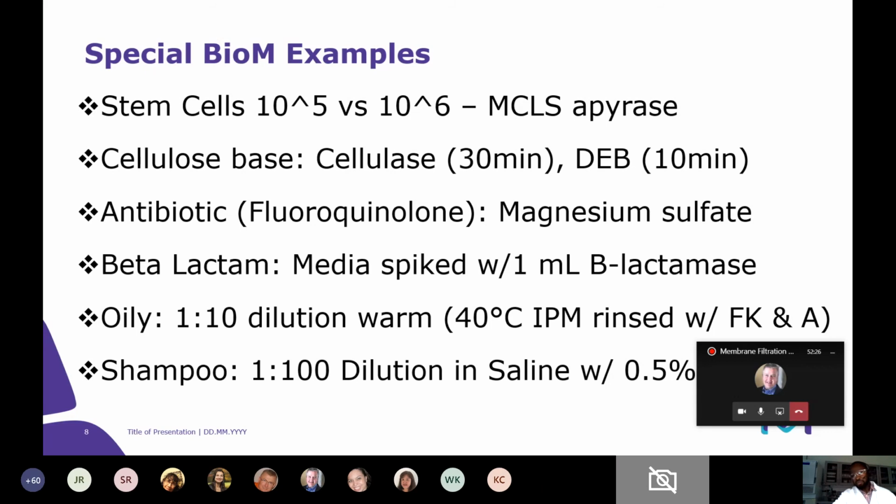You want to make sure you're not adding anything to it. At this time, it worked for us. Room temperature didn't work, but we had to use it. We had to warm it to 40 degrees for it to work. We used it in combination with fluid K, and the last rinse was fluid A. There were certain situations where we had to use 2 times 100 fluid A. We'll use 3 times 100 fluid K and 2 times 100 fluid A to get it to work.